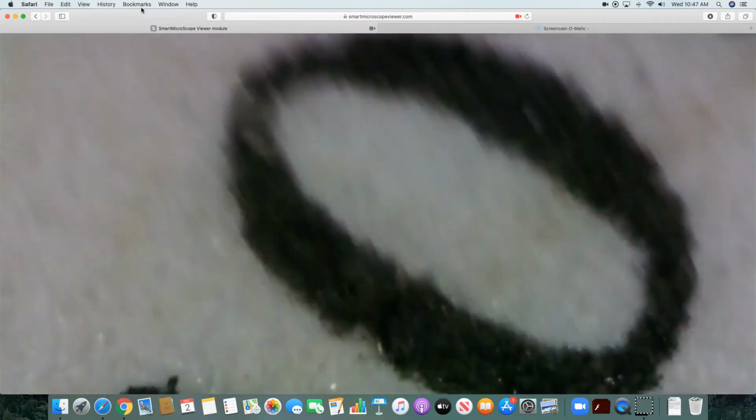All right, so now I'm going to switch. Same question, except this book. This is Harry Potter and the Cursed Child, the play script. This particular copy was printed in 2017, so this one is 3 to 4 years old. What do you notice about this paper? Just some things that you notice here about this paper printed in 2017. I'll scroll down a little bit. You can see the text here.